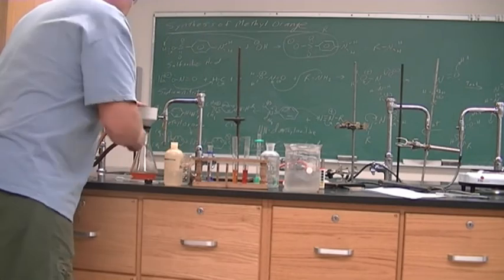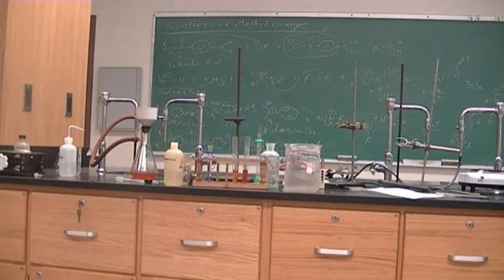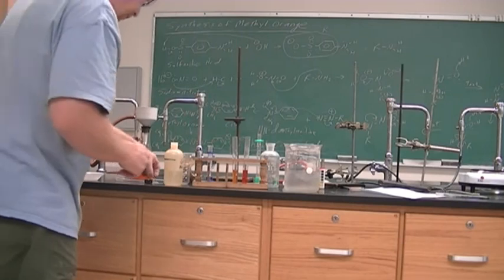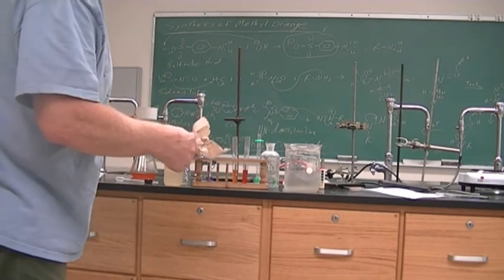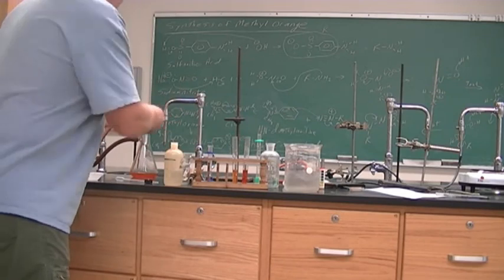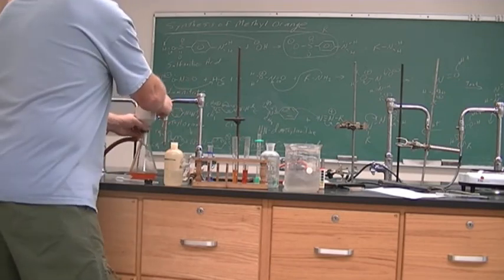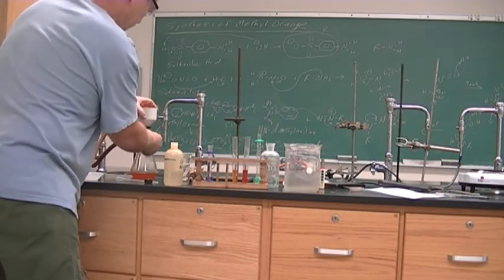All right, so here is our methyl orange. I will get a mass of methyl orange, and then you can calculate your yield. Everything is 1-to-1 for the calculations for your theoretical yield of your methyl orange. We are not going to get a melting point of this. We are just going to get a yield. So, turn it off.